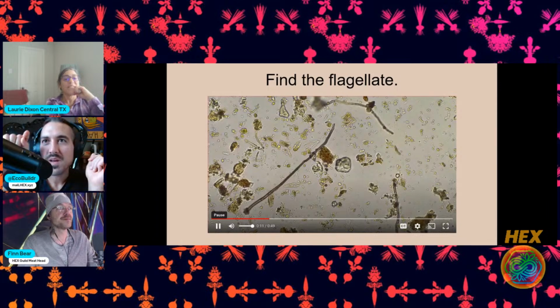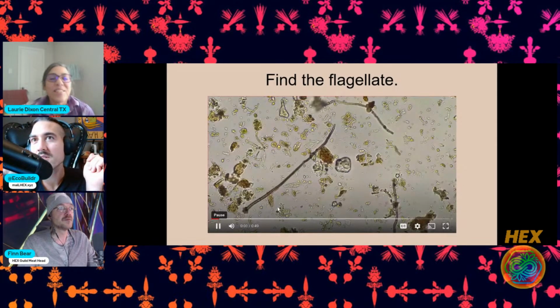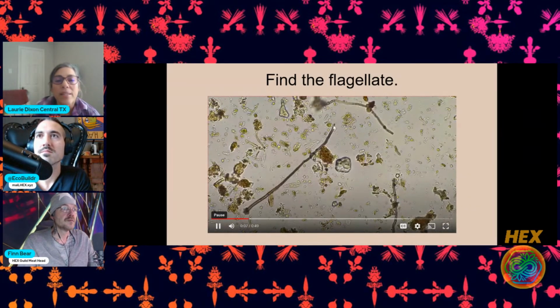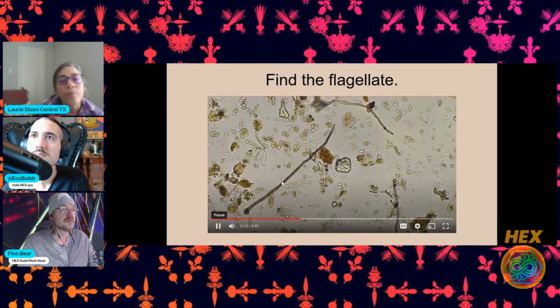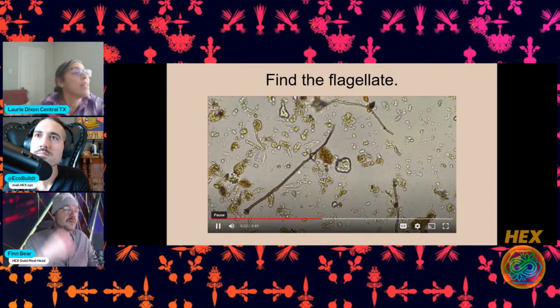Wow. Yeah, I see the little critter. He's the fastest moving, the most traveled. So this is really good. I'm pretty sure this is Johnson Su compost. These are fungi. A lot of times we look at the color. This one's gorgeous, a nice dark brown color. It has septa. I don't know if you can barely see them. They're basically the cross walls.